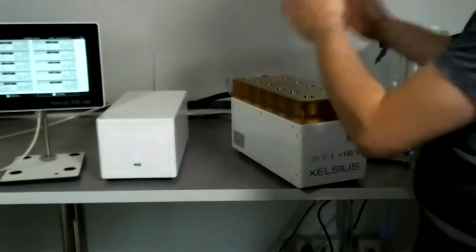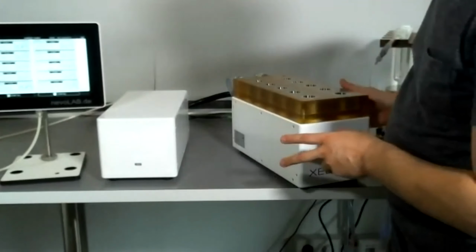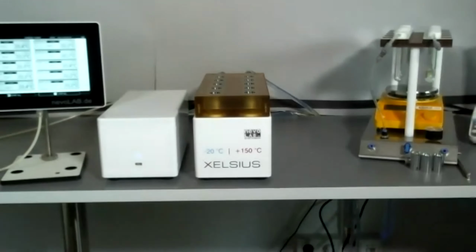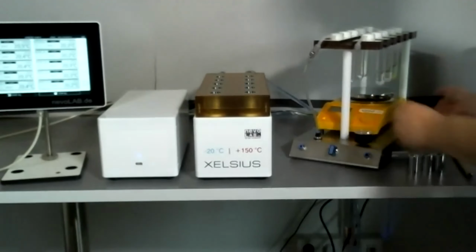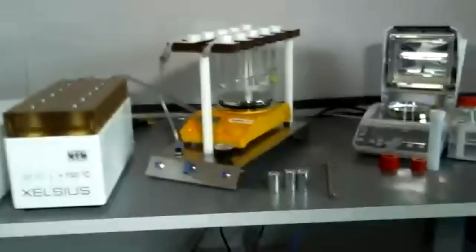Of course, because of the design, you also can use another liquid circuit if you want to use a high temperature difference. So then the next part here is, let's have a closer look for a better view.